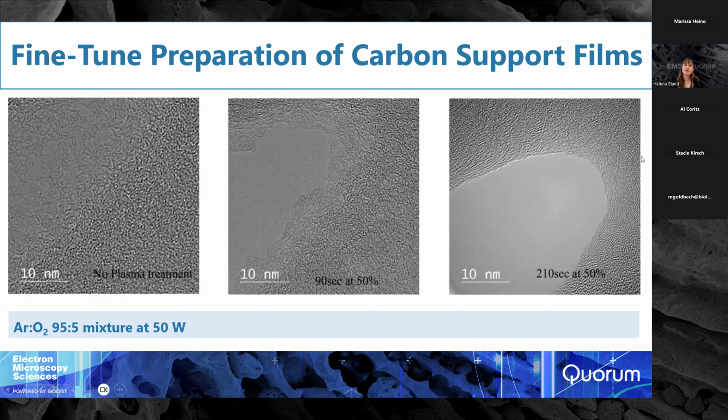That's really useful because it means that we can either etch away a film completely and recoat if there's been an issue. If you do coat your own grids with carbon, then you'll know that thickness is super important. So you can make a carbon coating potentially a little bit thinner using plasma treatment. And if you pre-buy your grids already coated, typically they've been stored in places where they might get hydrocarbon contamination, and you can clean the top using a much gentler power. So if you use, say, 10 watts, you could just remove the hydrocarbon contamination off the top of that.